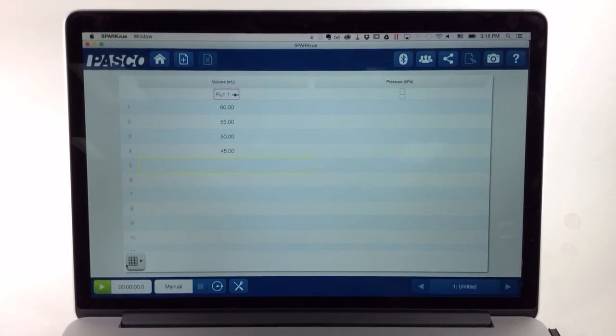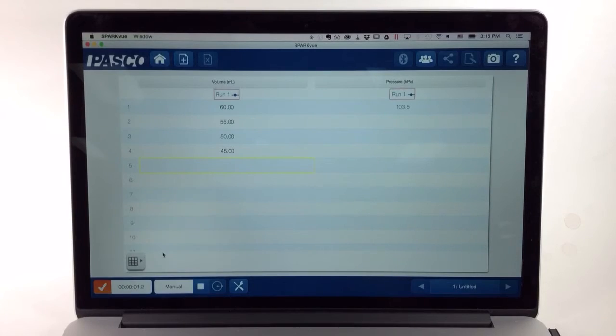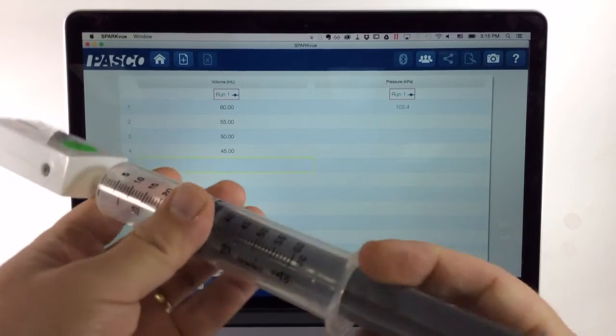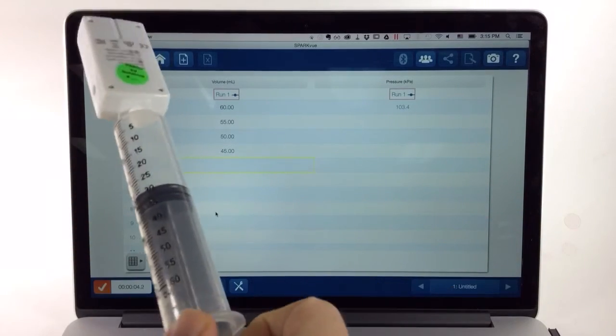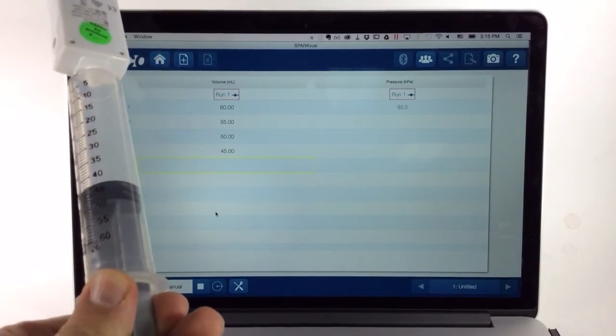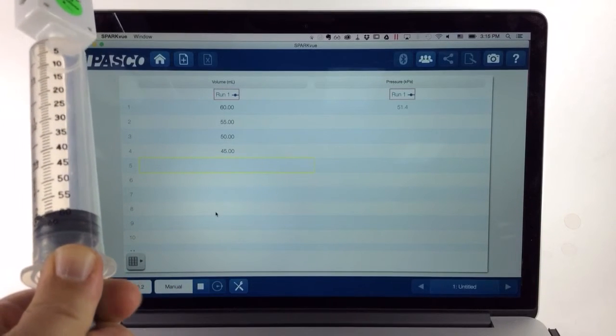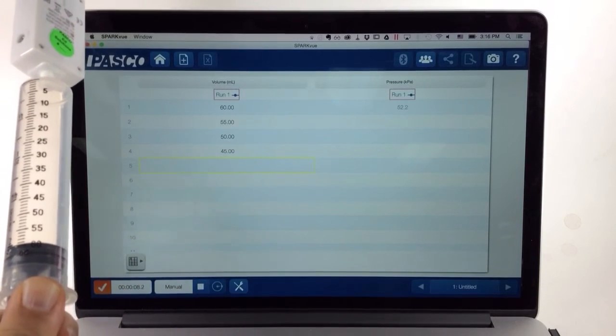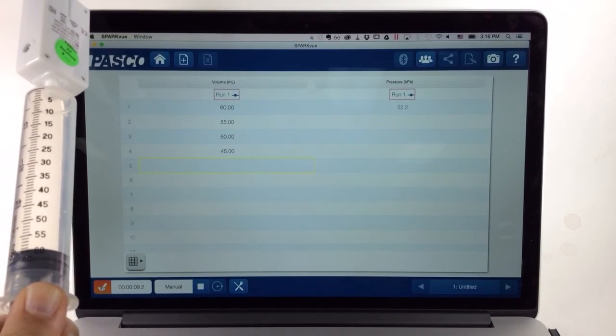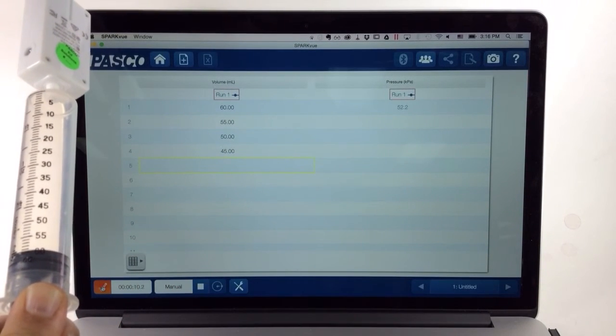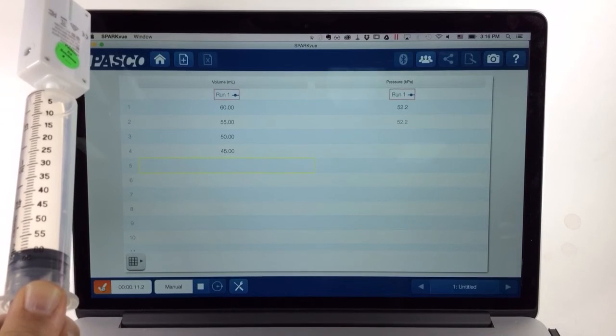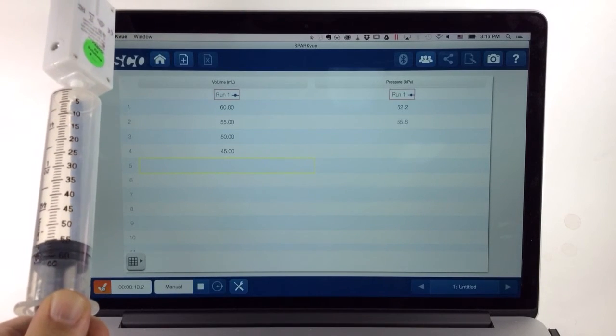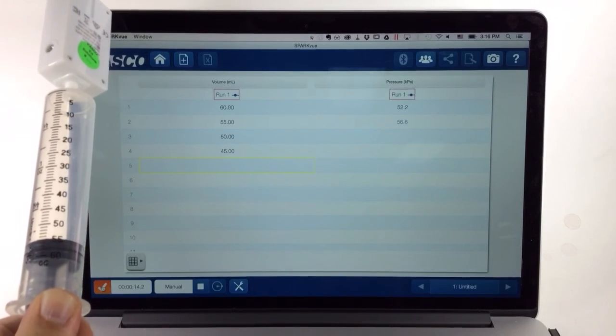The process will be to press Start, move the syringe to the specified volume in the table, and then press the Keep or Check button. I'll proceed to do this for each volume and pressure pair.